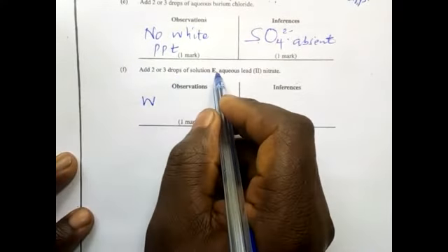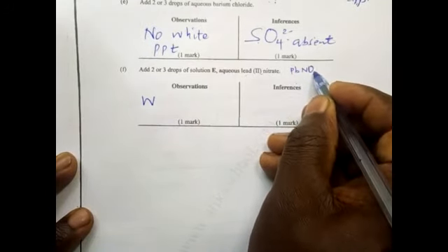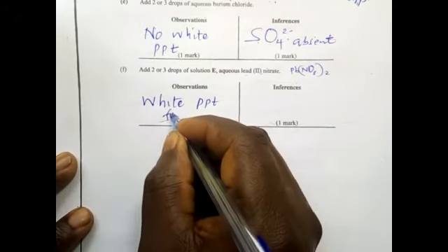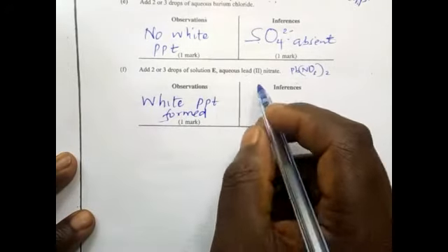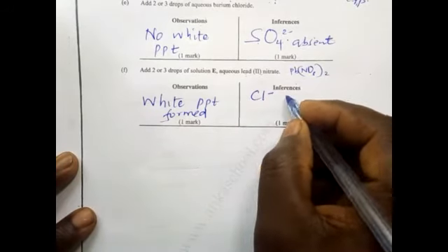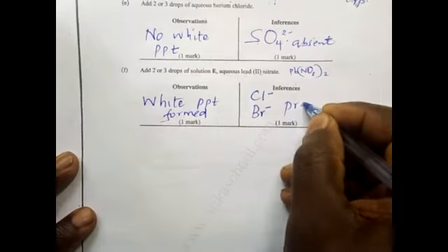We are adding lead nitrate. Then a white PPT is formed. That confirms that there is chloride ions inside. You can also say bromide ion present.